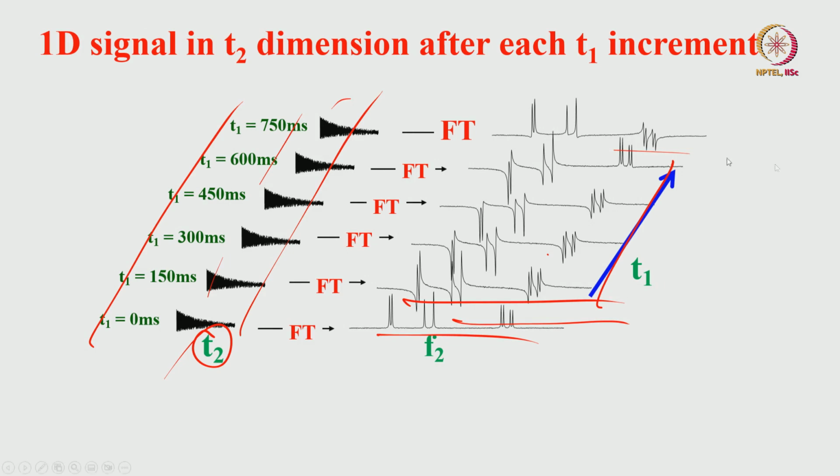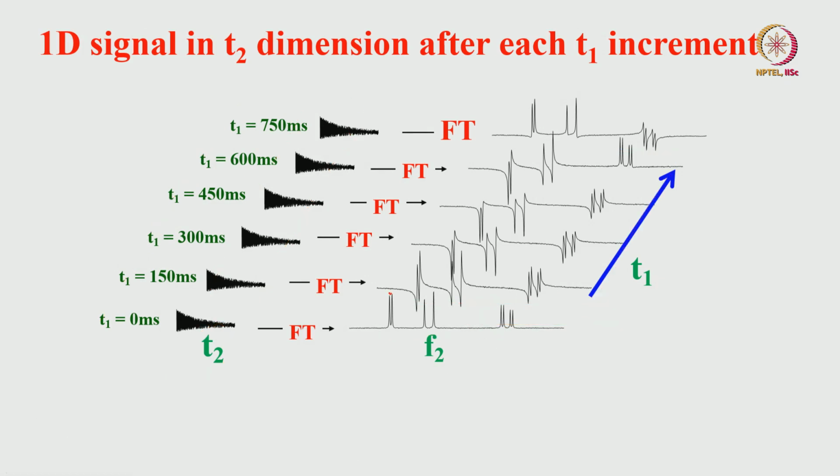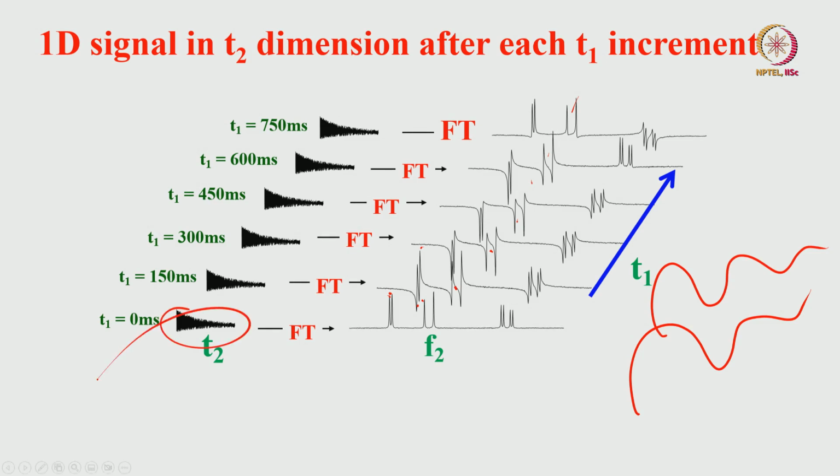What I am going to do is a trick. I will take any one of the signals here, for example this carbon, this proton, and measure the intensity and phases of that particular peak for all the T1 values and plot it. For example, take this one. This signal is positive, half negative, negative, negative, negative, again positive. So it starts like this. Intensity also is changing. Starts negative, goes positive, intensity changes. So there is oscillation going on. What is this oscillation? Similar to this one, an oscillatory and decaying function, a time domain function which is decaying.